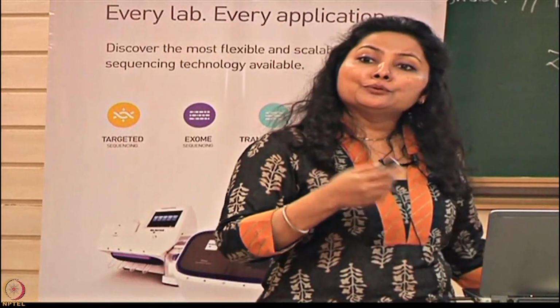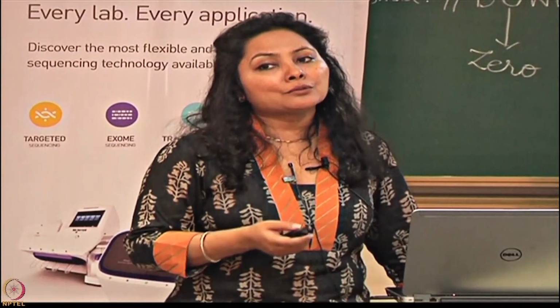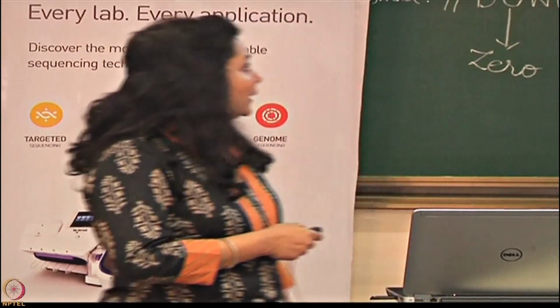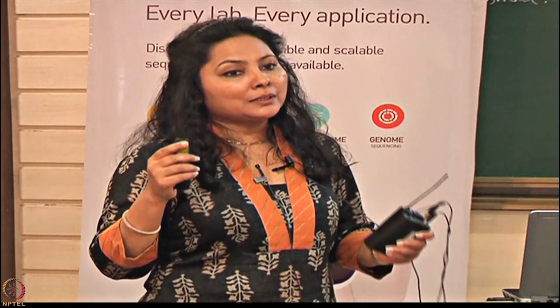The aim is that when you're doing small RNA sequencing, you generate equal amount of data for all these samples, because otherwise probably some of the samples have worked out pretty well and some will not. To ensure that, you need to pool all these libraries in equimolar proportion. So once you've pooled, after your library preparation step, you started with 12 samples or 20 samples, and now that becomes one sample. And now how are you going to differentiate? Because it is now one sample, but you started with 20 samples. So when you generate the data, how are you going to differentiate?